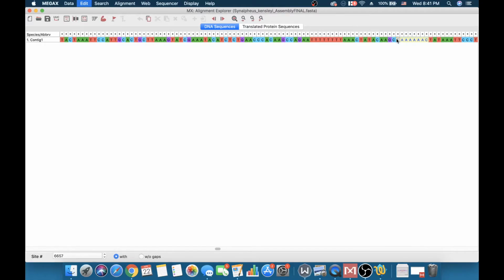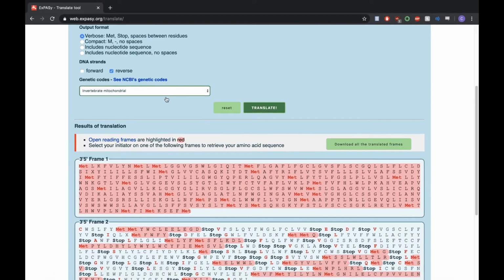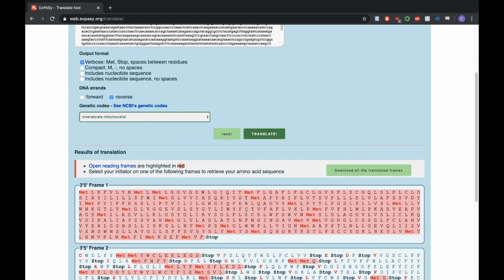The stop codon is going to be in this direction, and we're going to search for a stop codon keeping the complement in mind. So instead of CAA, we'd be reading this as GTT. The first possible stop codon starts right here, where we have a TAG. A TAG codon is a typical stop codon, so we're going to highlight this new part of the strand and paste it at the front in Expasy and hit Translate.